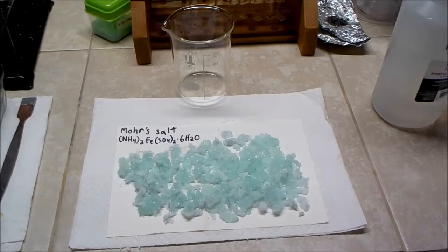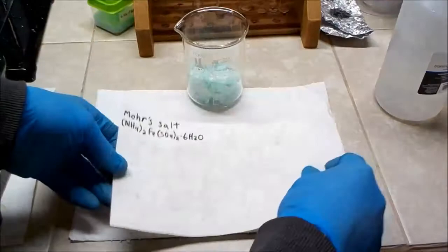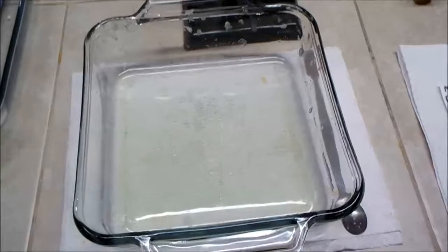So here we are after about 4 hours of drying, and everything looks like it's nice and dry. So I'll just temporarily store this in this beaker. Meanwhile, the remaining solution that I reduced down is back in this evaporating dish and starting to grow some crystals. I think I'll put that back in the refrigerator and let that set overnight.